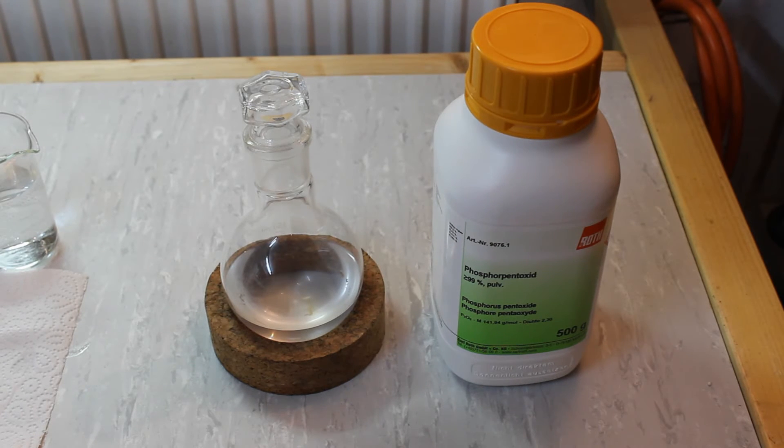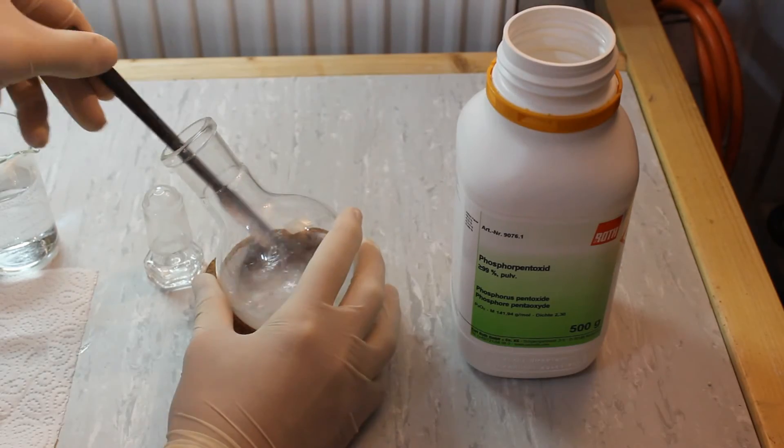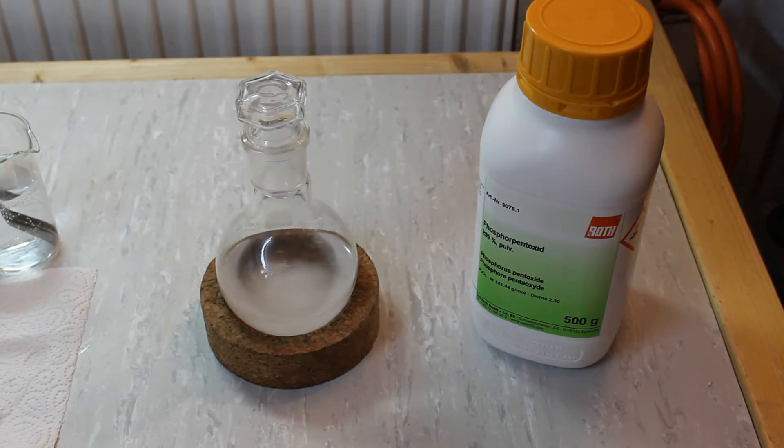I'm now adding the Phosphorus Pentoxide to the Bromoethane. I'll leave this sitting while adding fresh Phosphorus Pentoxide from time to time, until the Phosphorus Pentoxide no longer forms lumps.